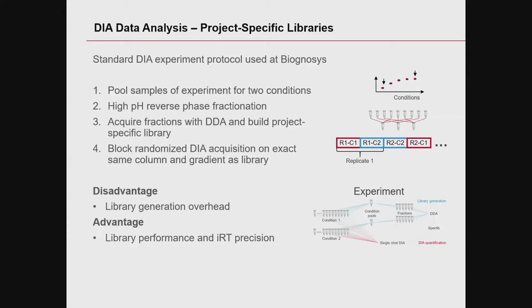Specifics about your sample prep are really reflected in the library. Your sample prep protocol on your samples, this can make a difference. And we can also use this iRT precision concept, which is very powerful in this kind of setting. That's the advantage. And here you can just see this workflow as a whole depicted. That's still the standard of what we are doing, even though now this also starts to change a little bit, as I will show in the end.